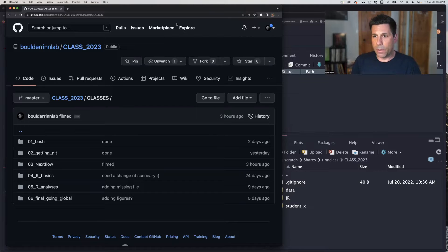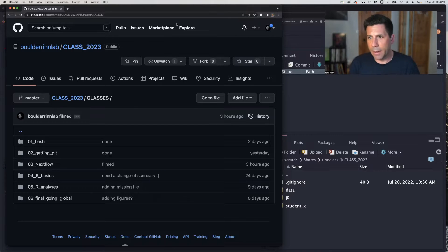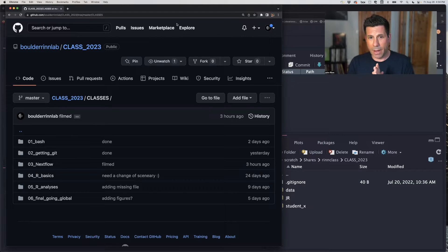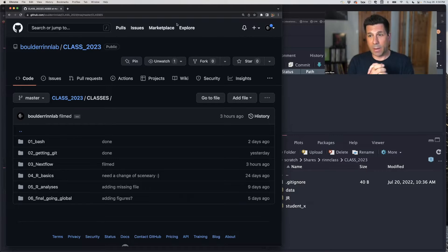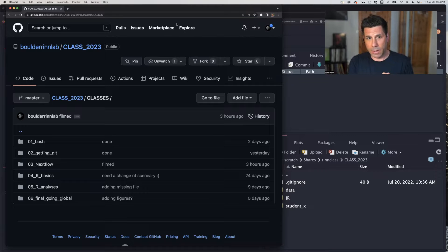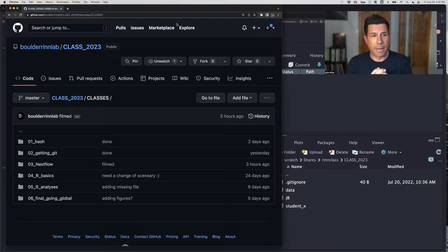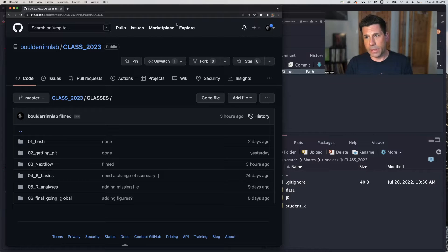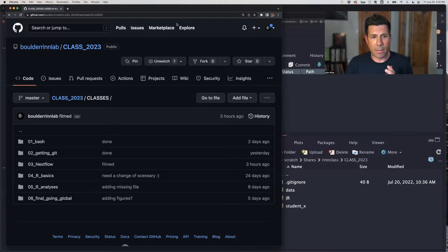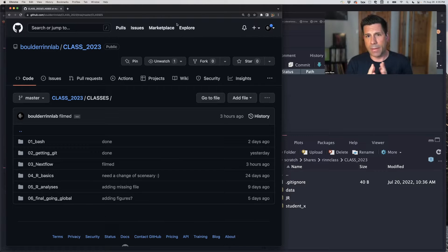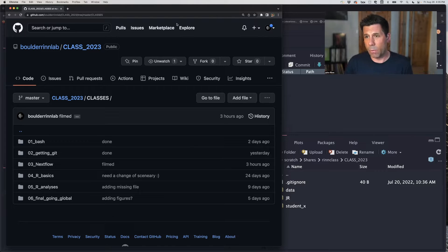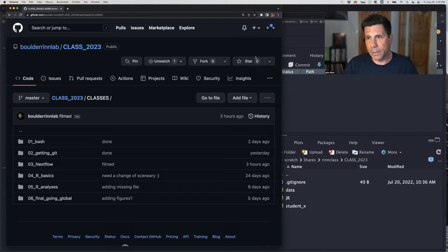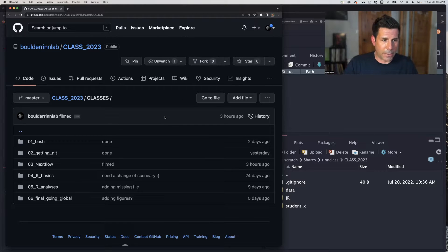Hello, everybody, and welcome to our next class. We have just run a ChIP-seq pipeline and got a bunch of analyses already from that pipeline. And now it's time to analyze the data. But first, we're going to have to learn some R skills that we'll use to analyze all of that data. So the next few classes are going to be teaching you the basics of R using RStudio and analyses that will provide the fundamentals of what is a ChIP peak file, what's in there, how do I find overlaps, things like that. And then we'll move into more specific analyses on your data set.